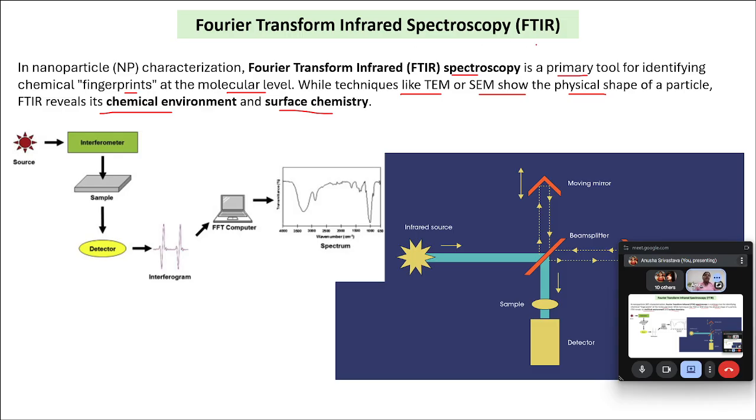Now, why is FTIR useful when we are talking about nanoparticles? Suppose, as in the previous sessions, we were discussing that we can decorate the nanoparticle with some antibodies or some capping agents, or we are modifying it, putting a layer of protein, a particular kind of targeting protein, or an RGD sequence or anything for that matter. Now we want to see if this particular coating or decoration that we intended to do has happened or not. So in that case, we can do the FTIR of both the samples.